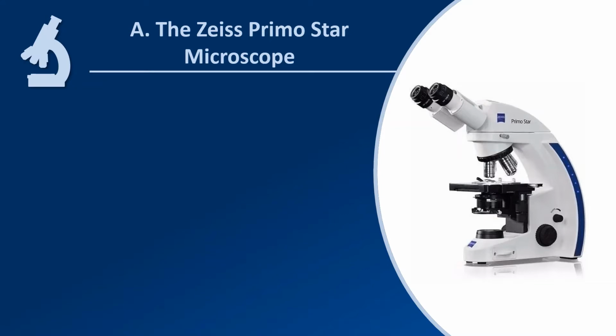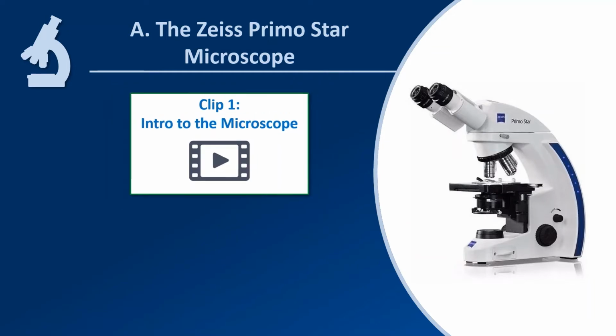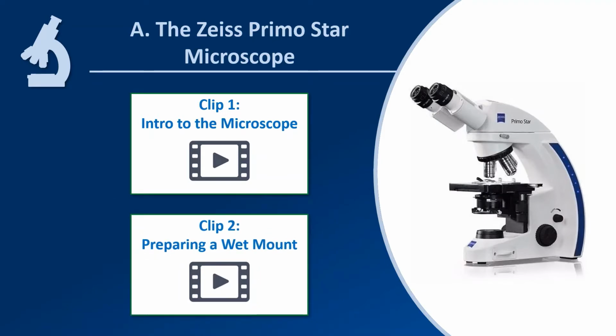For the microscope that we're using in today's lab, I have 2 video clips that I'm going to play here right away. The first video clip is an introduction to the parts and functioning of the microscope. And the second clip is how to prepare a wet mount. I'm going to play those for you right now.